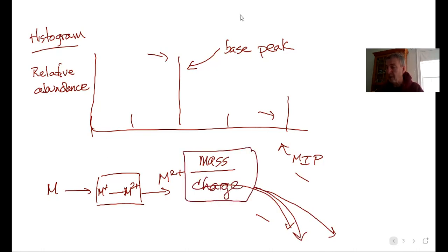In other words, the x-axis, which you think would be mass, is not. It's the amount of mass over the amount of charge. And how that looks on a typical MS is M over Z. So let's hypothetically say this is 80. We fully expect a peak to exist here. Maybe it's small, maybe it's big, at 40.